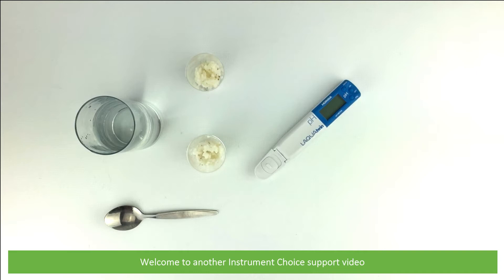Hi and welcome to another Instrument Choice support video. In this video we'll show you how to measure the pH of sushi rice using the pH 22 compact pH meter.